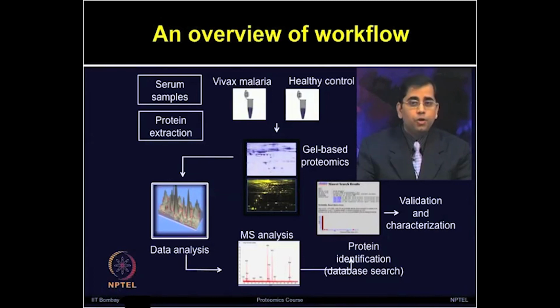vivax in human serum. Serum samples were obtained, proteins were extracted, and the protein samples were compared from the healthy and vivax patients by applying gel based proteomics, including 2-dimensional electrophoresis and difference in gel electrophoresis.